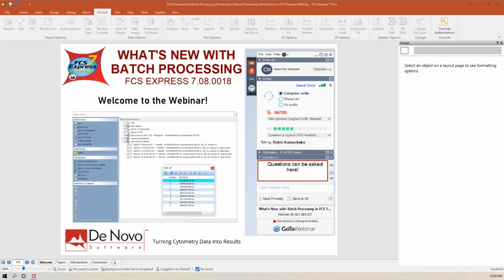My name is Robin Kamucheka. I'm a technical application specialist with Denovo Software and FCS Express. Today, we're going to be going over batch processing, and we're going to tell you about what's new in our latest release, as well as covering some of the standard features just to give you a nice, well-rounded presentation today.